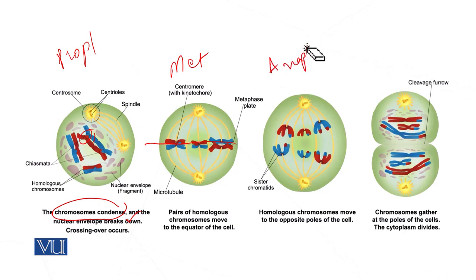After anaphase 1, in the last stage, the chromosomes have reached the opposite pole. The cleavage furrow forms and two daughter cells are produced. But this is not the end of meiosis — this is the end of meiosis 1, and after this these two cells will undergo further division.